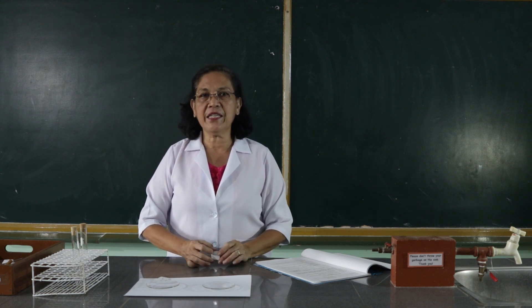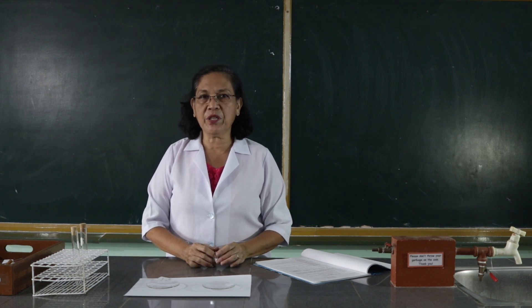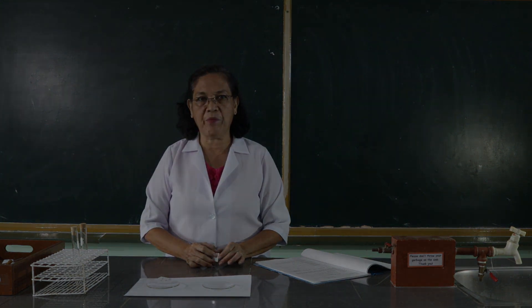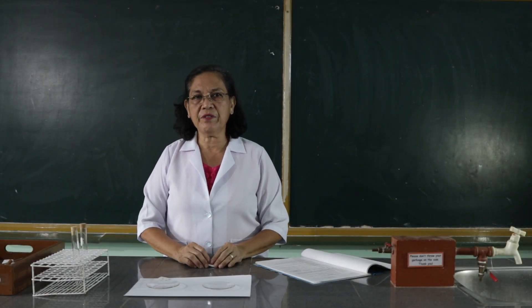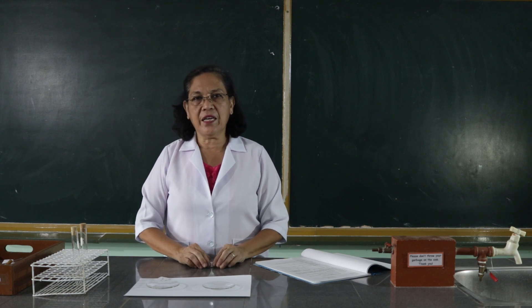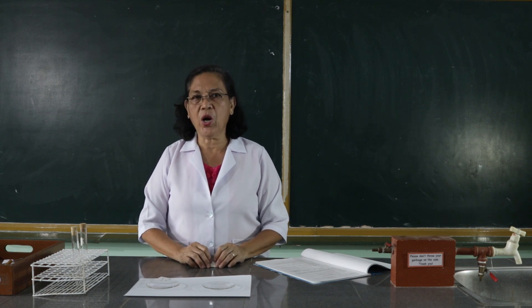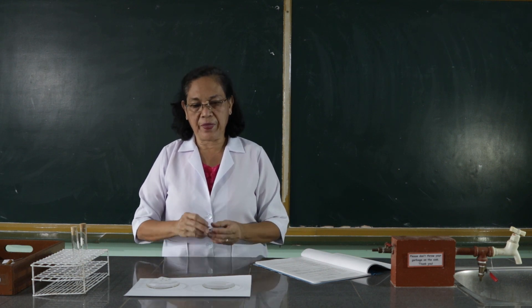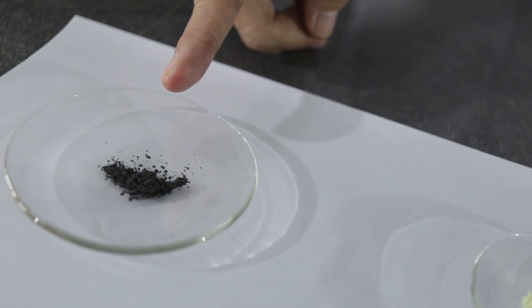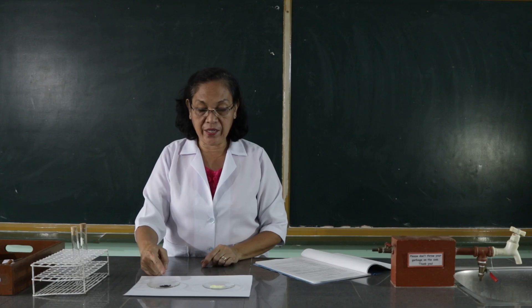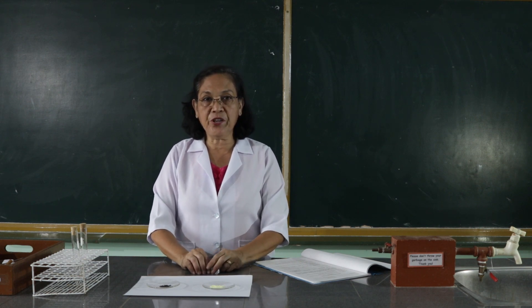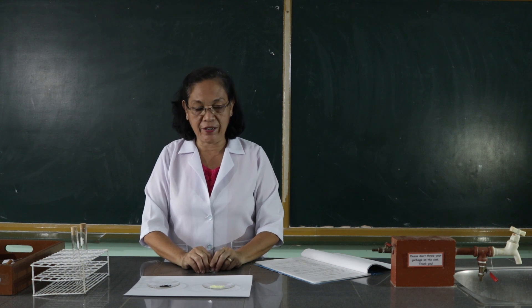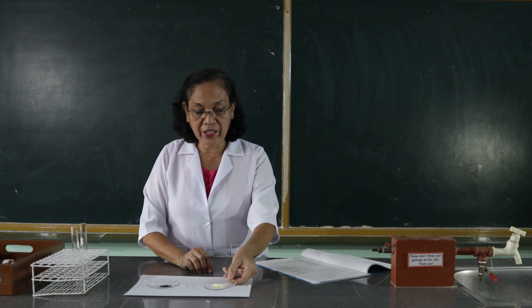Kindly listen attentively and observe as I'm going to do a demo. The first part of the activity is we're going to observe the physical state, the color, and the solubility of sulfur and antimony. This is sulfur and this is antimony. We're going to observe their physical state, the color, and the solubility in carbon disulfide.